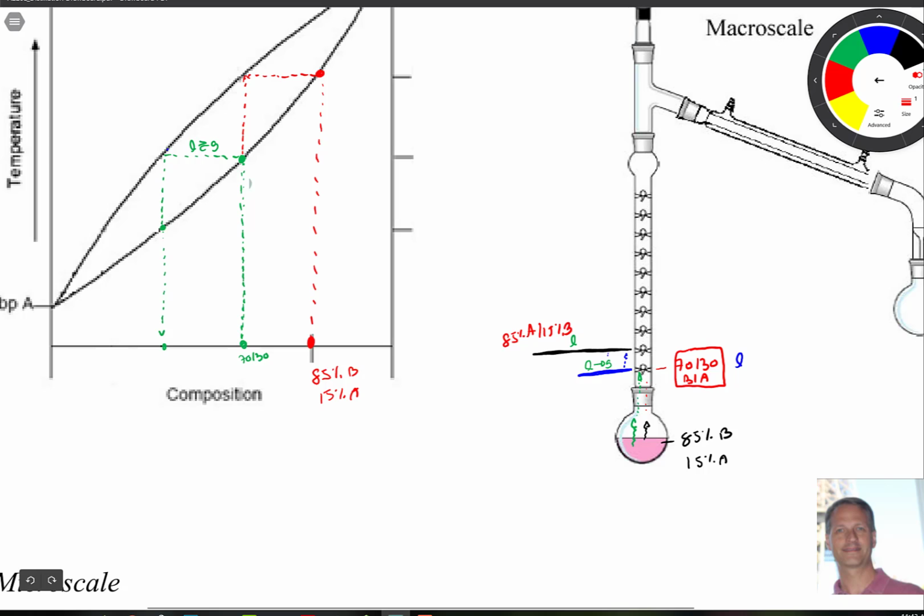And then what happens is we have more vapor coming off, right? There's liquid still here. So that green vapor that came off here condensed at step number 1, and it caused the stuff that was at 1 to go to number 2. Now we have more coming up here. We have the third burst of vapor causing step number 1 to turn into gas, which is hot gas that moves up to step number 2, which causes that to move up to step number 3. So that comes over here just like that.